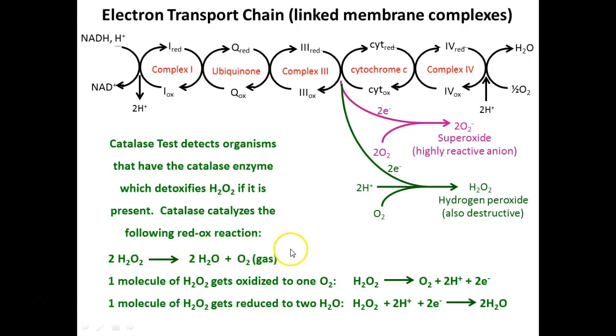It's a redox reaction, right? Loss and gain of electrons. So hydrogen peroxide, and this is the important formula you want to write down for your unknown report, right? Breaks down into water and gaseous oxygen. So remember, the bubbles that we see is the oxygen gas being released as hydrogen peroxide is broken down into water and gaseous oxygen, right?